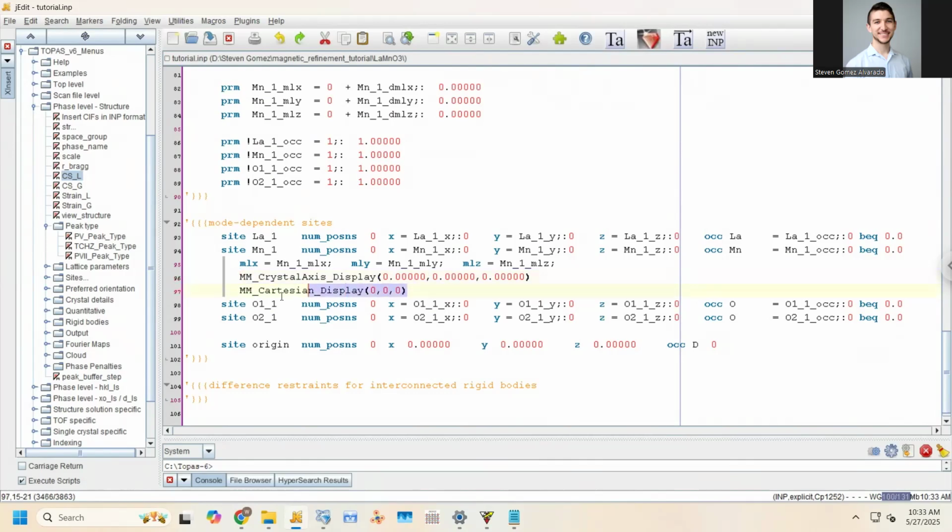But more generally, you basically want to look at this because in the Cartesian world, you can calculate the total magnitude of the moment by just saying x squared plus y squared plus z squared, just like we're used to calculating the magnitude of a vector. You can't always do that if your vector components are not 90 degrees apart, which is what this would give you. So just be careful. Make sure you're calculating the magnitude of your moment using this function.